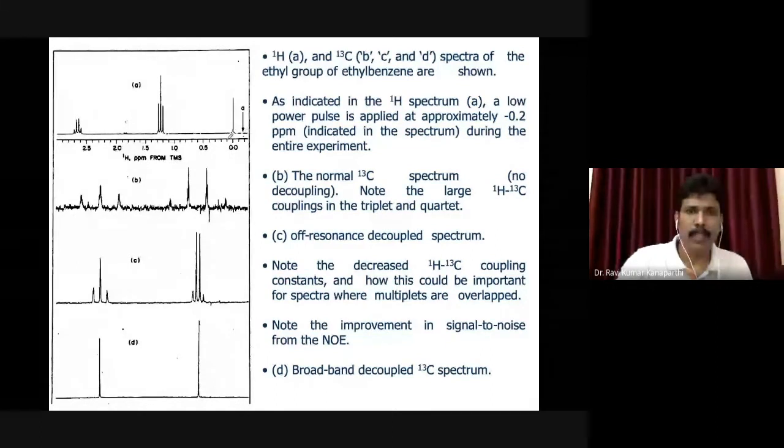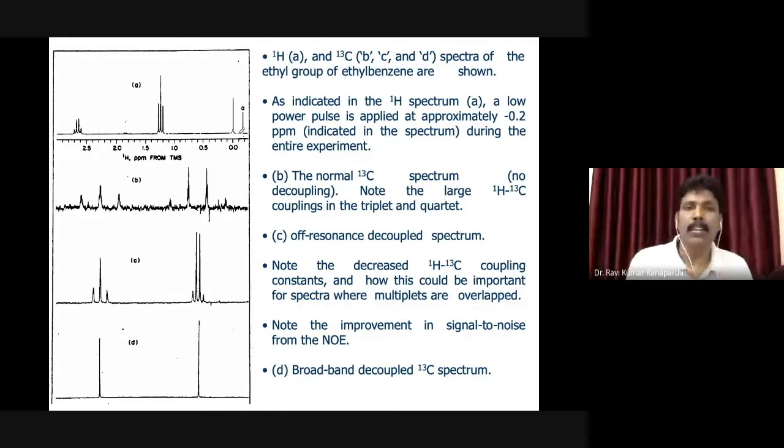As you can see here, in this case, the C13 NMR spectra are recorded using the decoupler frequency at this frequency, minus 0.2. Okay, at that frequency, the resonating frequency. I mean, this is a delta in ppm. Please remember that the x-axis is the ppm scale, delta scale, but it is nothing but the frequency. So this is basically the shift from the standard or reference, right? The x-axis is the frequency, and it measures how much a proton signal is shifted away from a particular frequency.